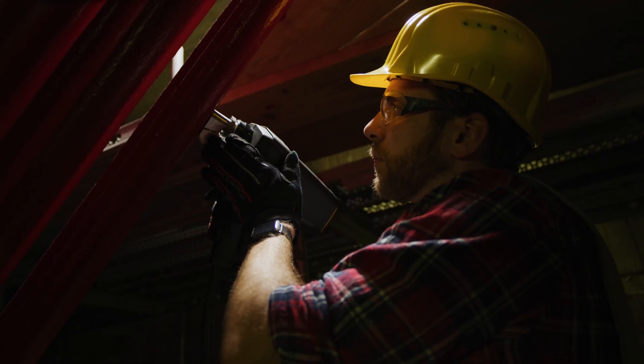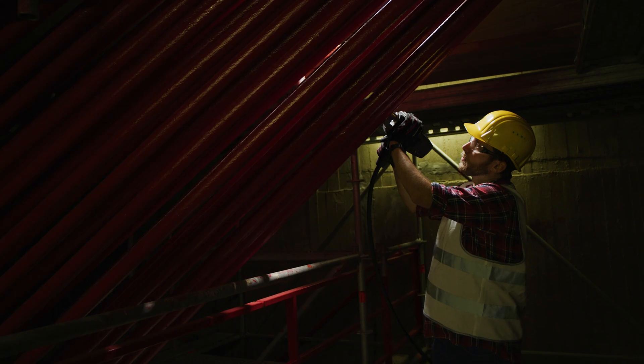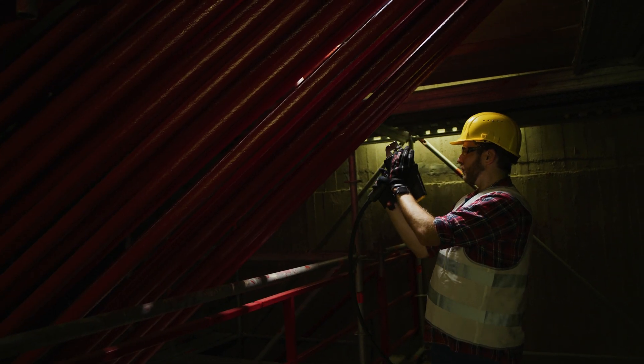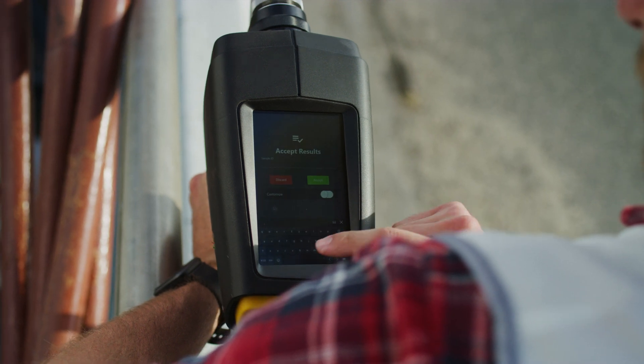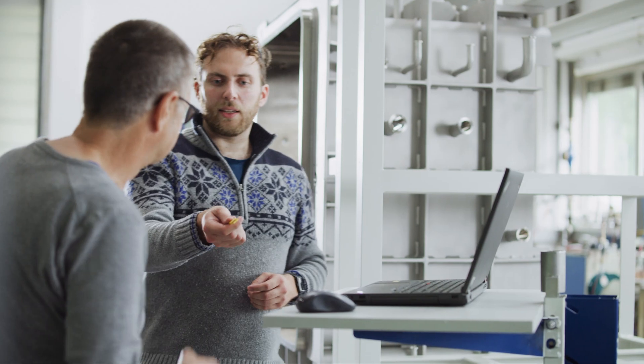Handling easier than ever. Control each step directly via the display on the hand probe. Developed for mobile. Completely intuitive to operate.